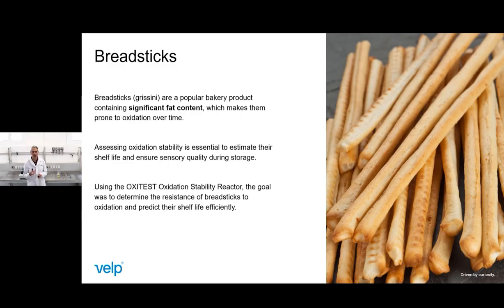Until now, we understood this concept, and now the question is: is it possible to estimate the shelf life of the product using the oxy-test reactor? Well, the answer is yes. Using the oxy-test, it is possible to simulate an accelerated aging of the sample at different temperatures, and estimate what the shelf life should be in a different temperature condition.